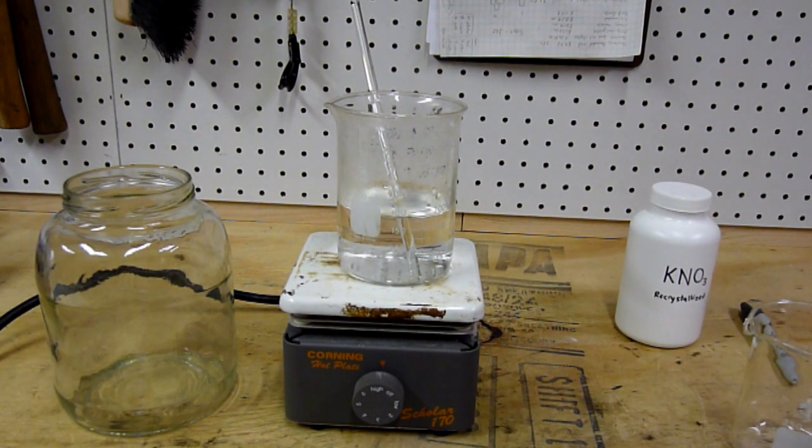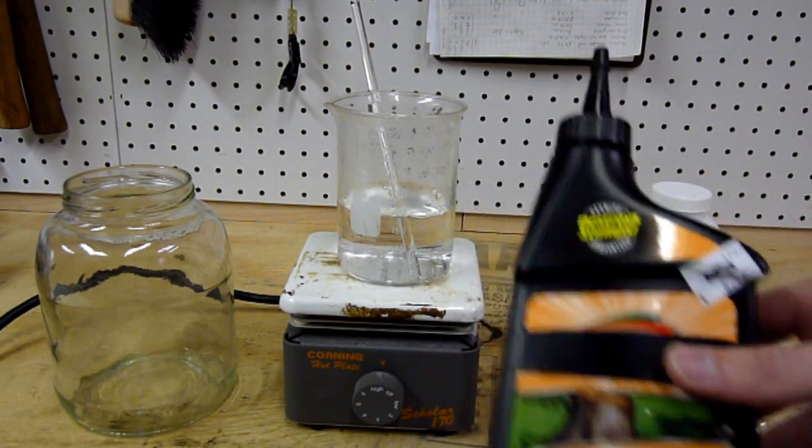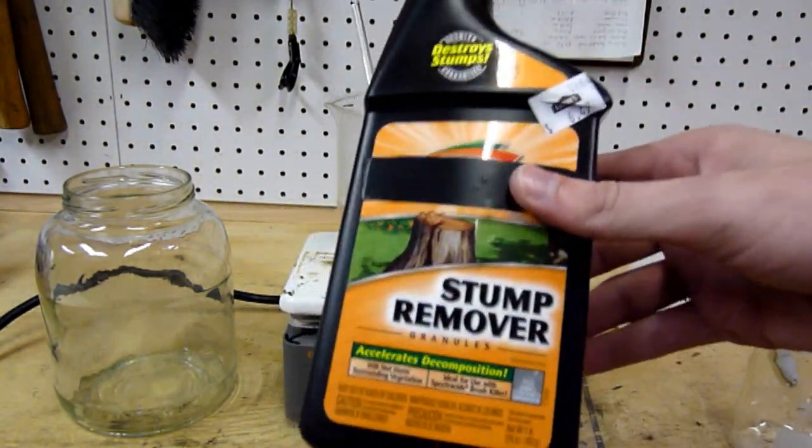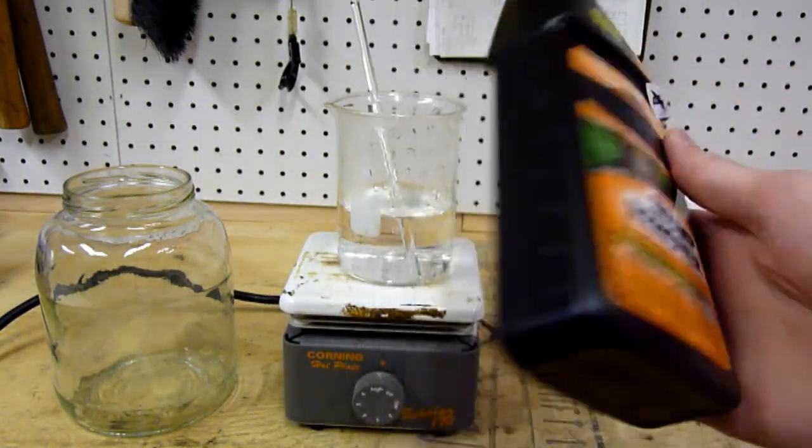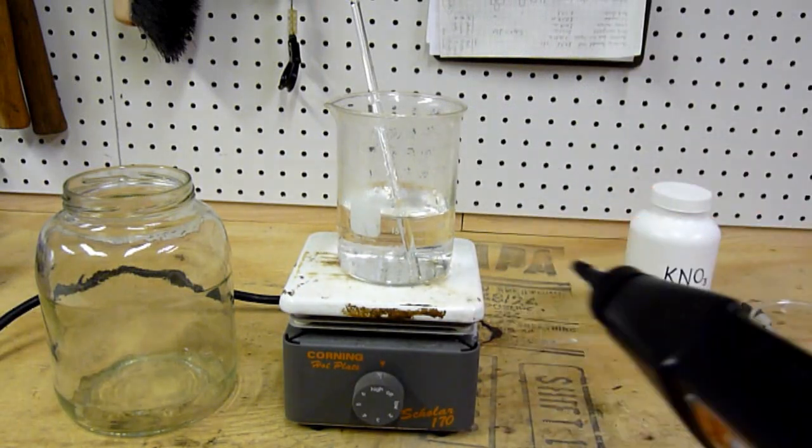So what I've prepared today is 200 milliliters of boiling water, and we're going to purify potassium nitrate found as stump remover in most hardware stores using the recrystallization method.